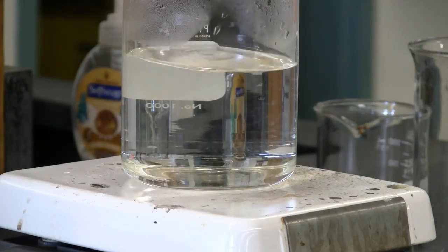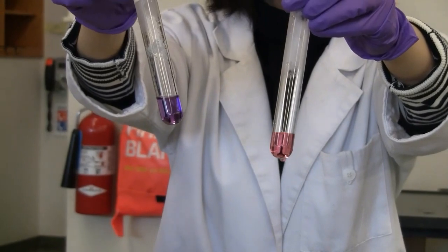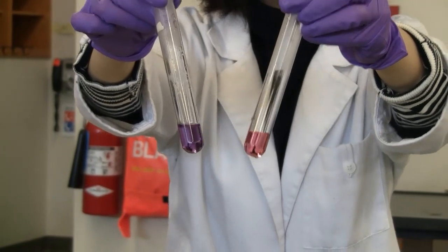Okay, now take a look at the change. You see that this one with ammonium chloride, this one is a control. When heated, it moved to what side? Which side? Okay, all right.